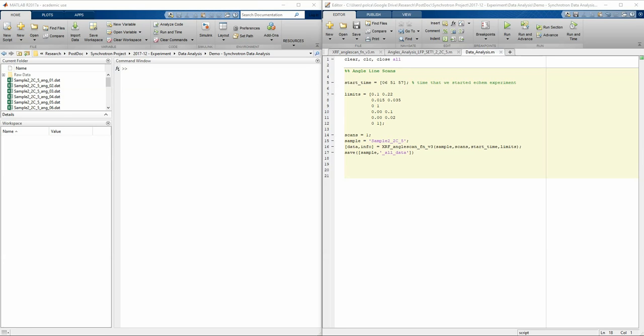Hey guys, so in the last two videos, I showed you how to save your data, how to rename it, and then what's actually contained within the data file. So now that we're ready, let's look at how to actually analyze the data in MATLAB.